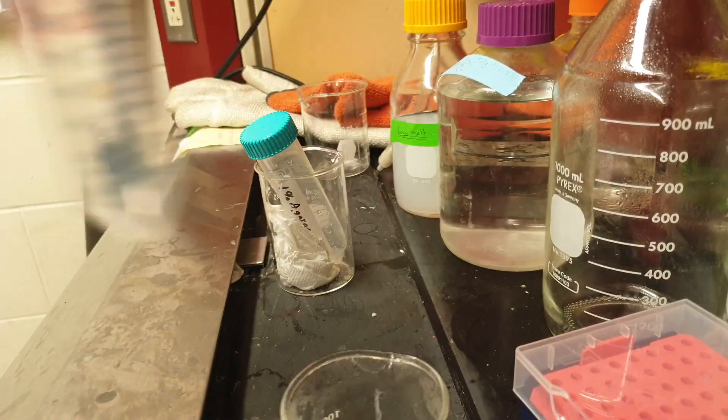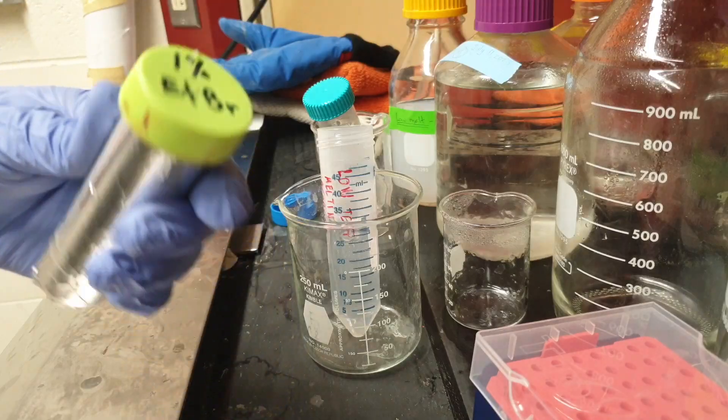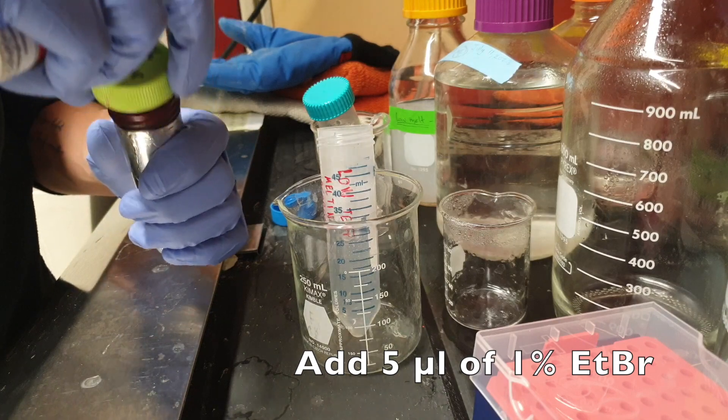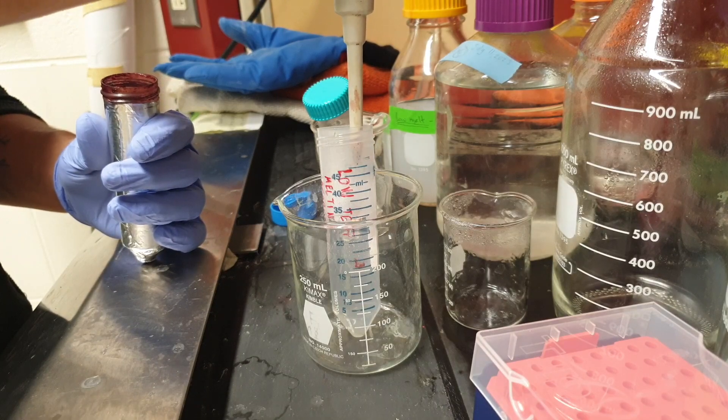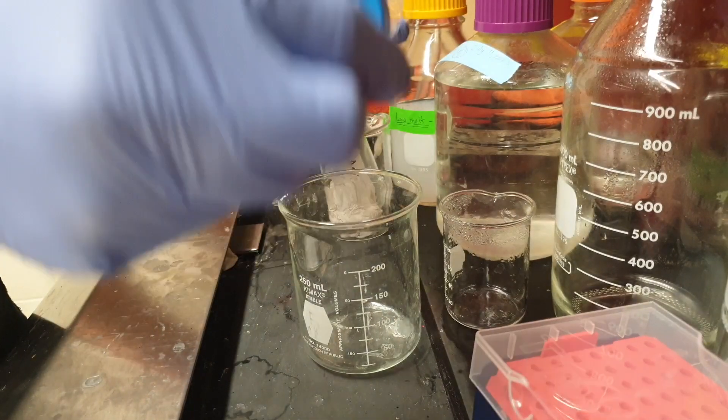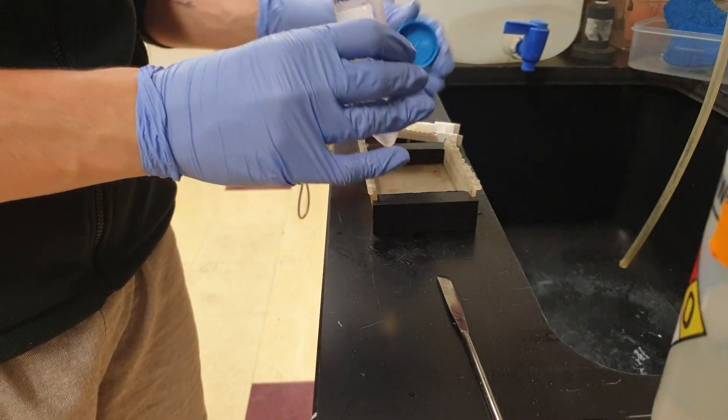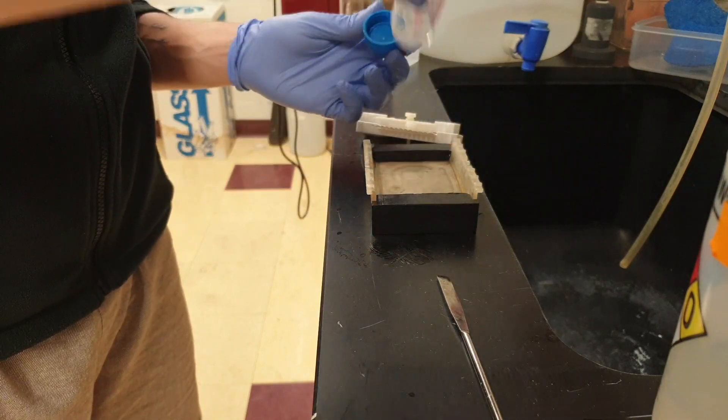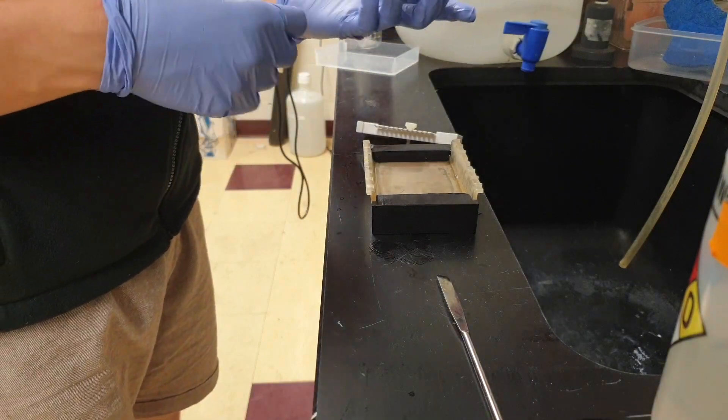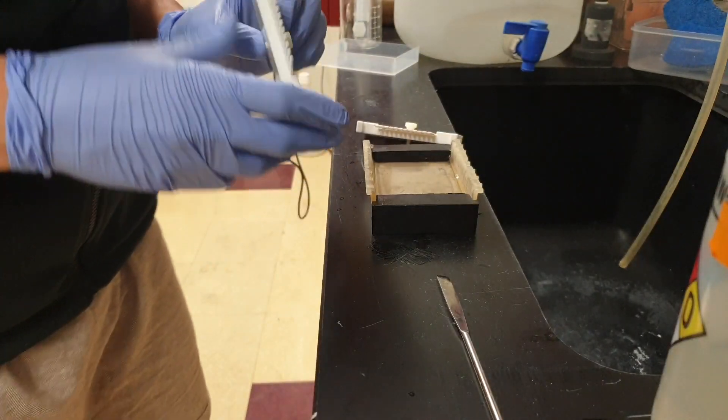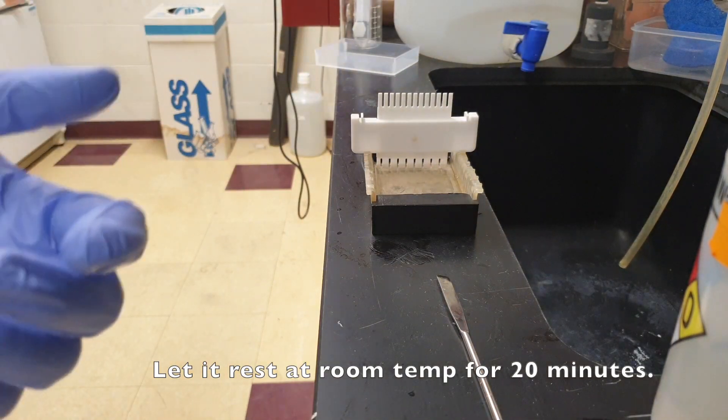Adding 1% ethidium bromide, 5 microliters. Let it wait for 20 minutes.